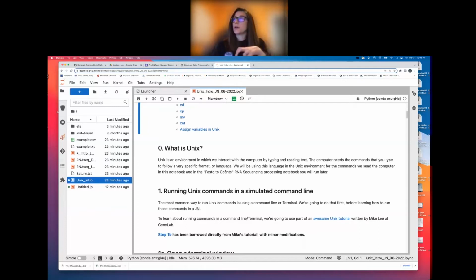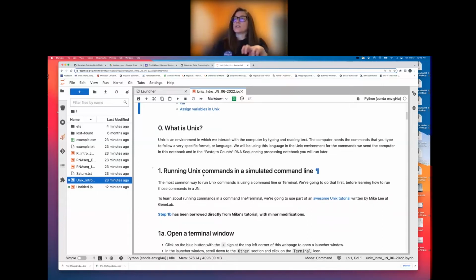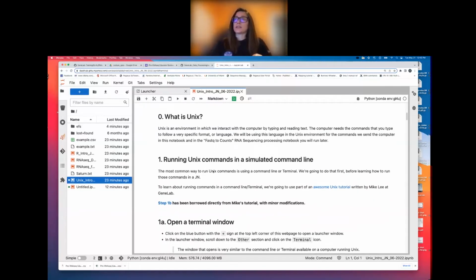And so when we do this notebook and also our intro to R notebook, which we're going to start tomorrow, we're going to be mostly staying within the system and doing this hands-on environment. So as Lauren mentioned, the nice thing about these notebooks is we can write text here in addition to being able to run commands. So you can follow through. A lot of this content I went over in the lecture, so they're going to be going over some more of it during the notebook to hopefully solidify the information and then running the commands.